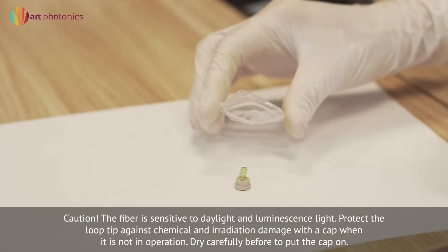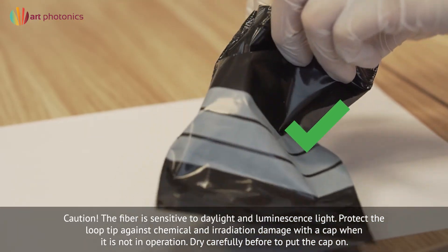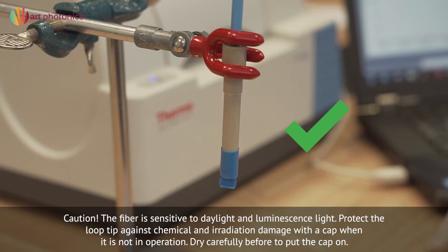Caution: Polycrystalline fiber is sensitive to daylight and luminescence light. Protect the loop tip against chemical and radiation damage with a cap when it is not in operation. Dry carefully before putting the cap on.